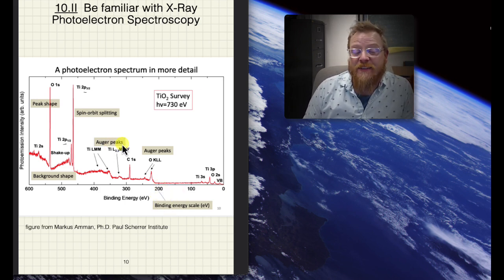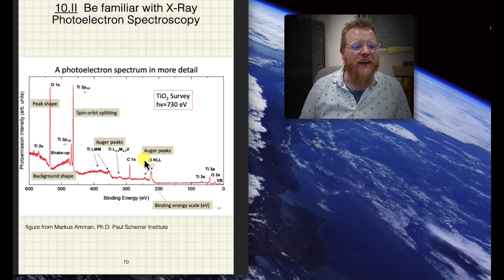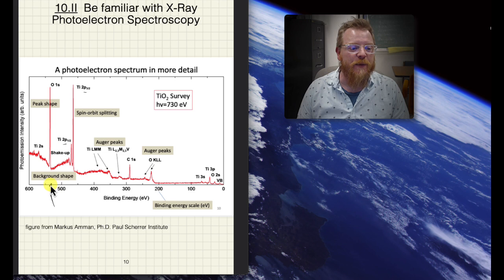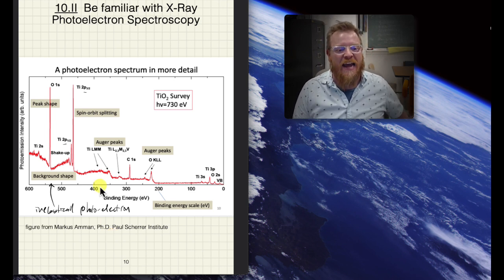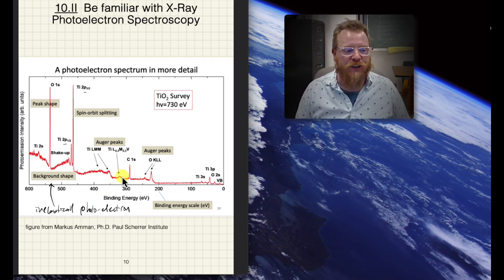Our Auger peaks that we talked about will show up in this spectra. And then now what you should also notice is the background, or really baseline shape for this, is quite wonky. And that's typically due to inelastically scattered photoelectrons. So there ends up being a lot of stray electrons making it to the detector that are inelastically scattered off of the spectrometer or the vacuum chamber itself. And that just owes to this kind of wonky background shape.